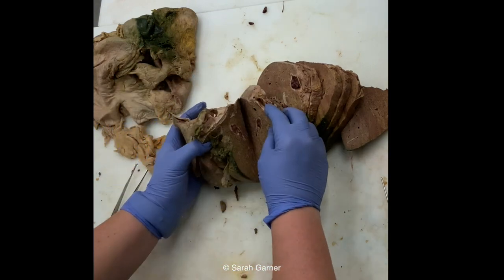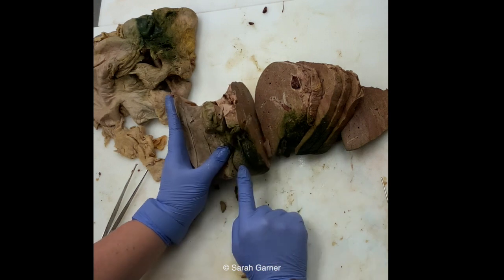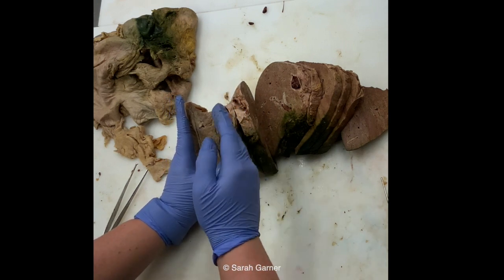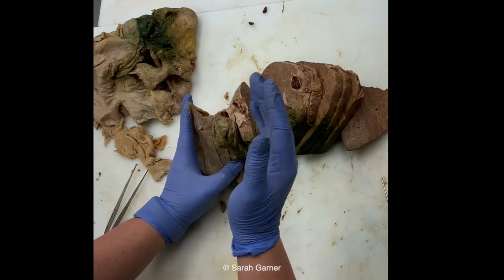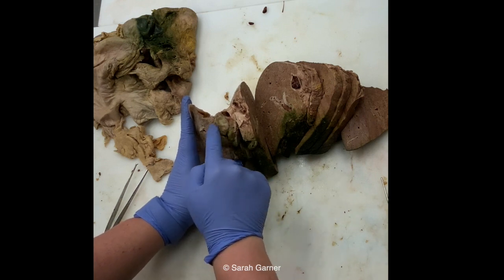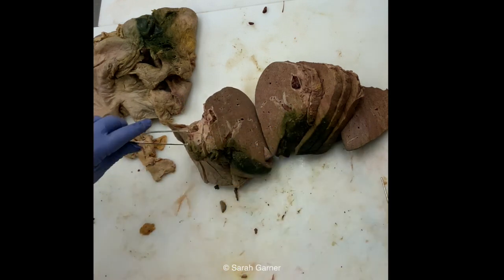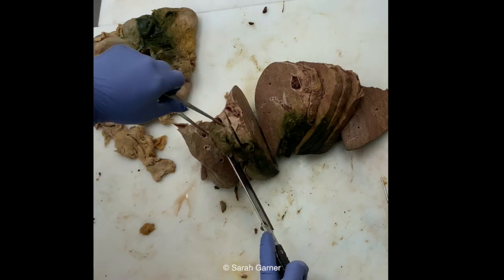Now, one of the tips that I have for people is don't forget about your caudate and your quadrate lobe. So here's your caudate lobe, here's your quadrate lobe. Oftentimes when you're cutting, you'll kind of skip those so that they stay intact, but you don't want to not look in there, because I actually had a case a while back where there was a tumor in your caudate lobe, and so if you don't cut into there, you might miss that. That's more like a surge path tip, but it's also important for autopsy. You don't want to miss anything, even at autopsy.